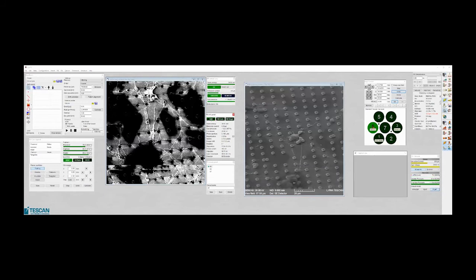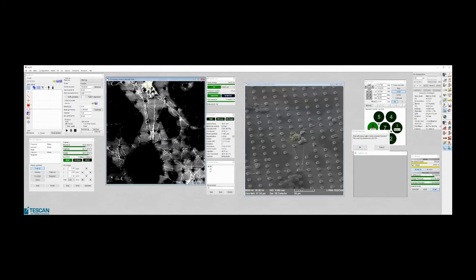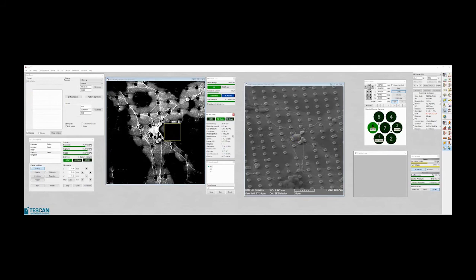Okay, something bigger here. It could be this one, this nice one, probably this one. So we will move with this one. Okay, so now it's more or less in the same position. A bit of focus, but not on the structure which we would like to see, because it could destroy it a bit.